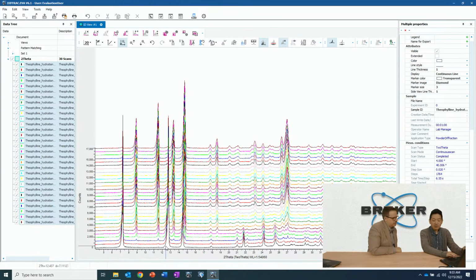Okay. So just to give you a little bit of backstory about this scan, I took this material and spritzed it with water, and you can have a couple of things happen to a material. Either it could get wet, and it's just a wet sample, right? Or the water can start to change the structure. The water can actually go inside of the crystal structure.